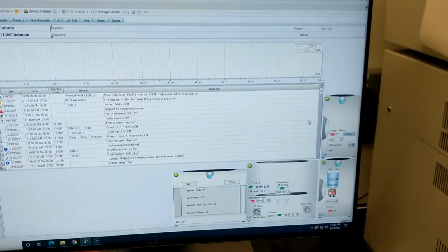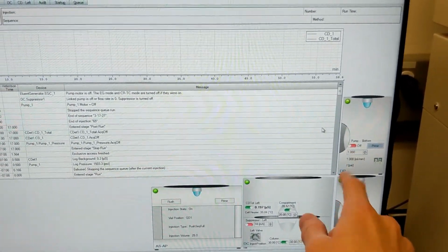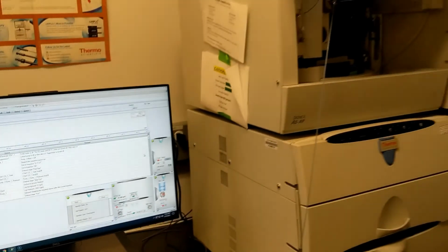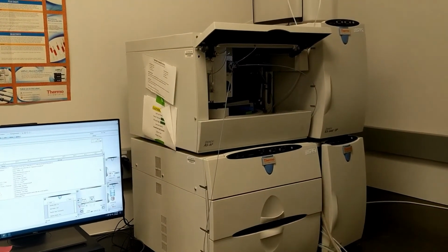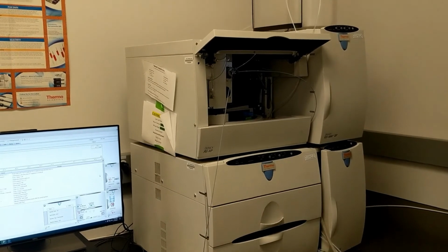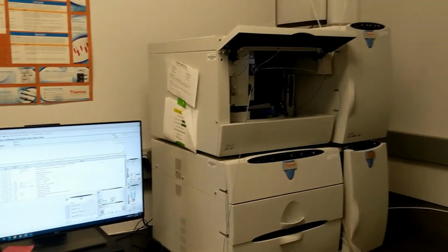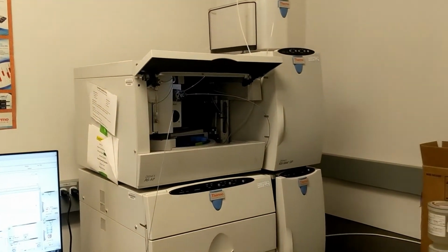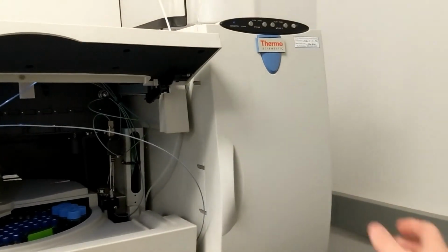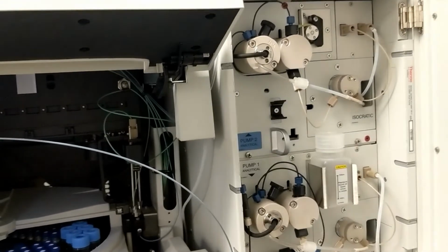So if we look here, and we'll talk about this software a little bit later, if you can see that it's red here, it means the pump is off. Normally, and hopefully if someone is running the IC correctly, the pumps actually won't go off. It'll be kept in a low flow, what's called idle mode, but that is not the case right now, just so I can teach you. So let's prime the pumps. The first thing we need to do is open up this pump compartment, and we need to open these prime valves.